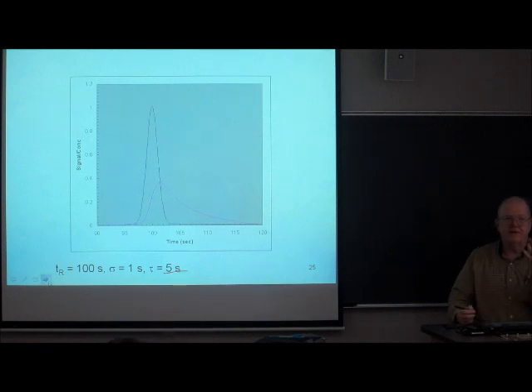Now, the question naturally arises: if I know that this is going to happen, why not make the time constant 0? The answer is that all real signals have noise, and all real signals require filtering to reduce that noise, to a certain extent. But if you over-filter, you do more harm than good.